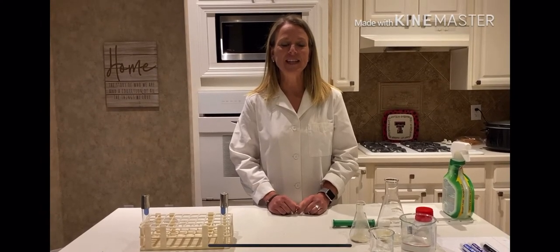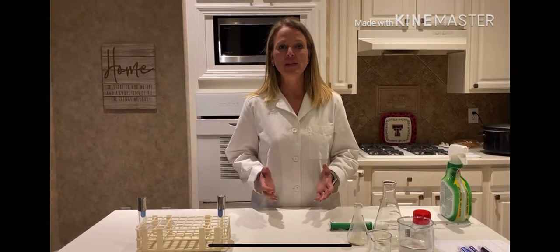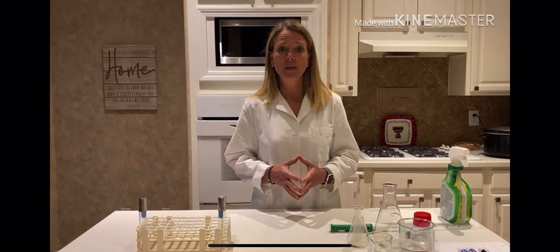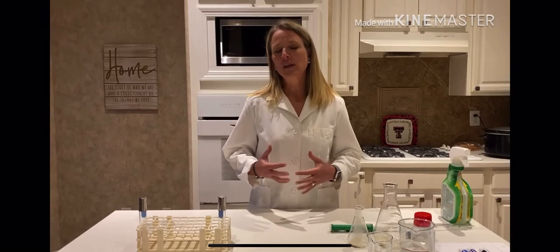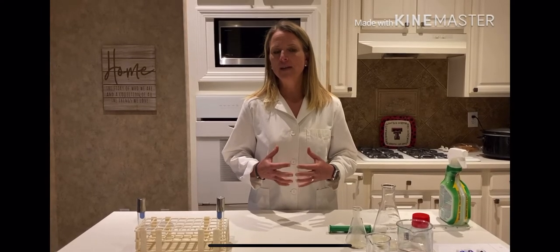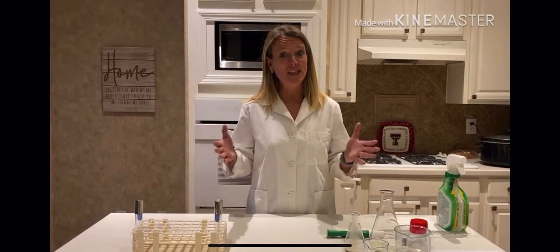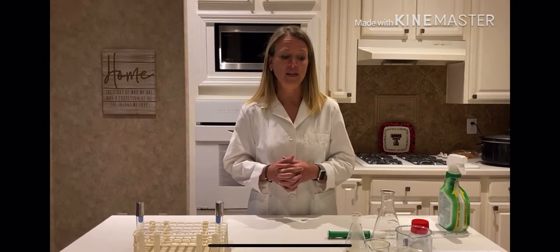Hi, I'm Erin McKenzie and today I'm going to be talking to you about lab tube, which is going to be nutrient agar and nutrient broth preparation. I have included a video from YouTube so you can see how plates are poured, but I'm going to use my kitchen to do a makeshift lab on how you would do this in a lab situation.